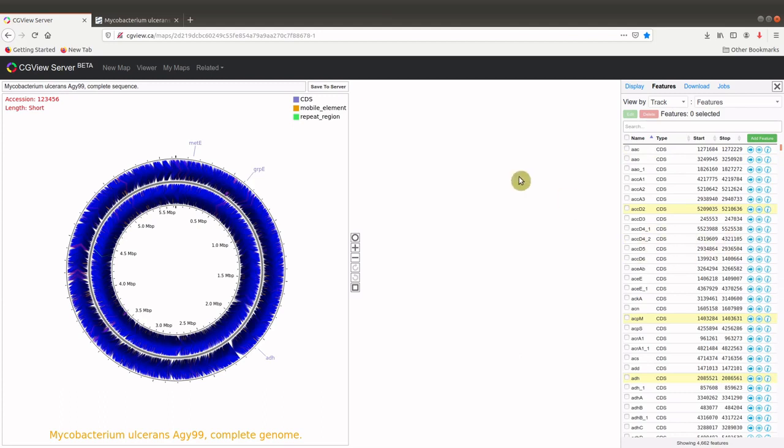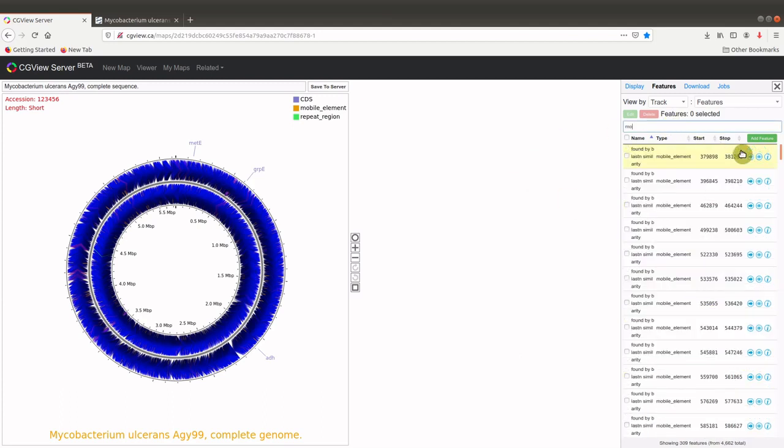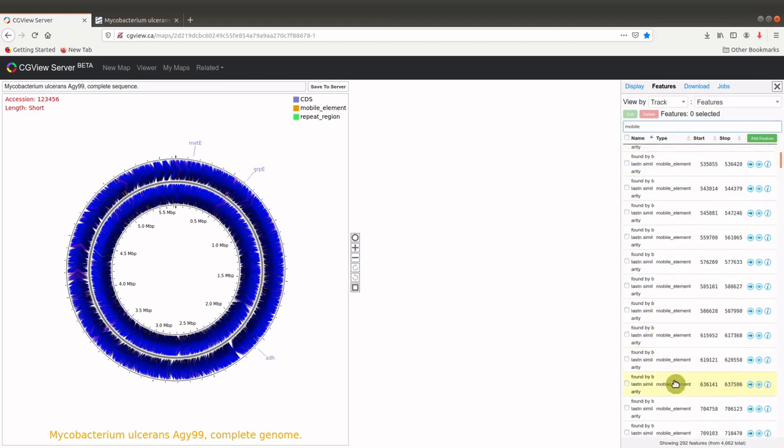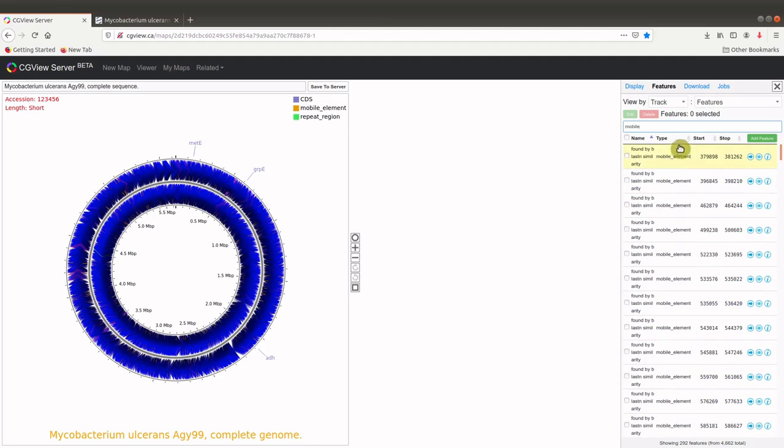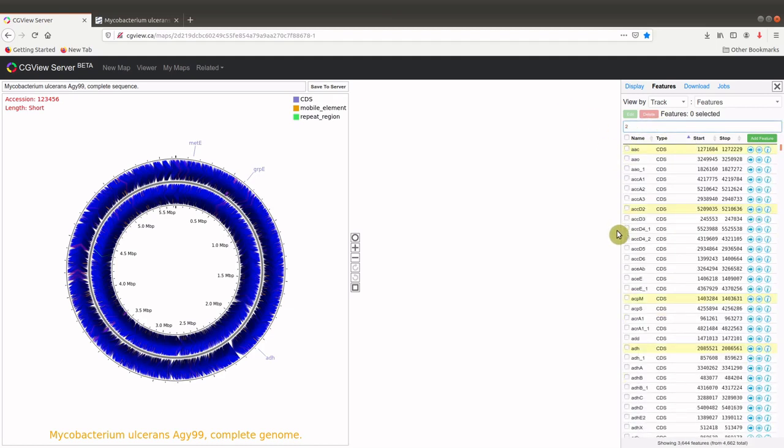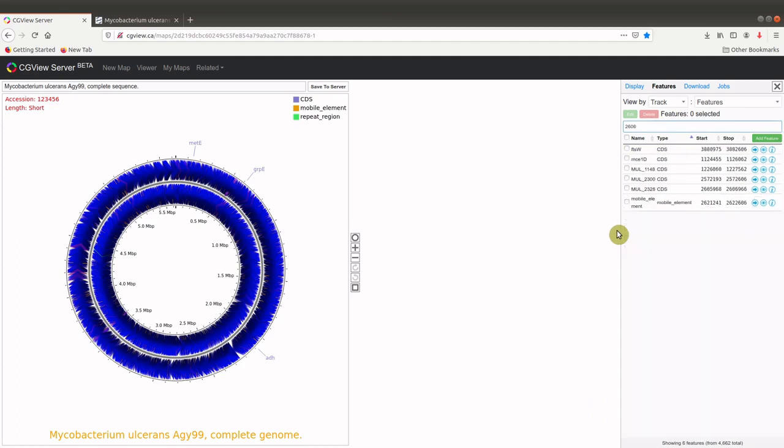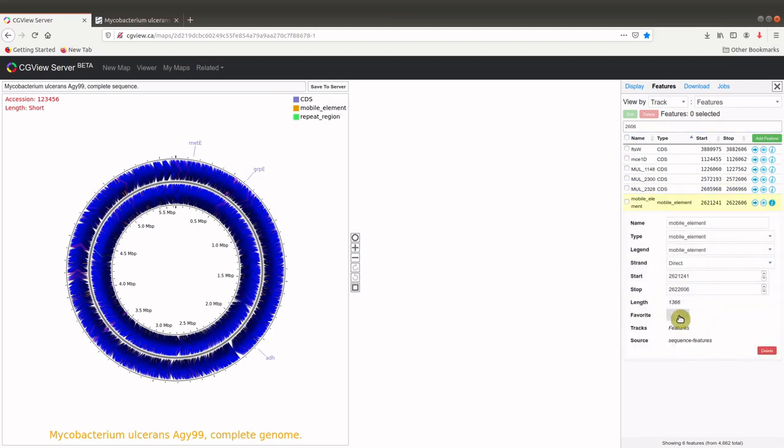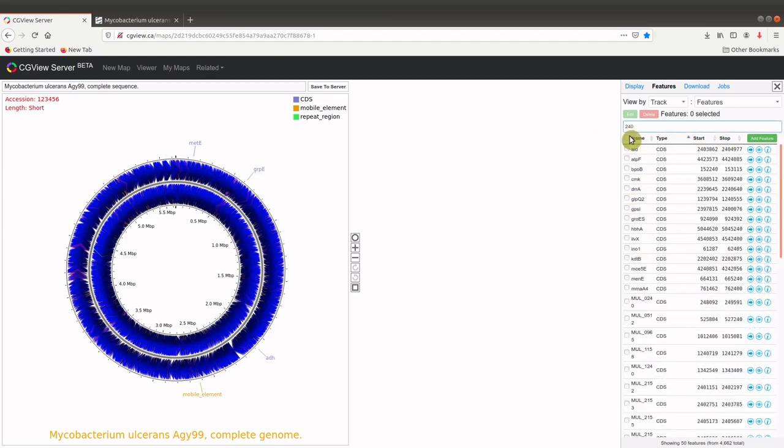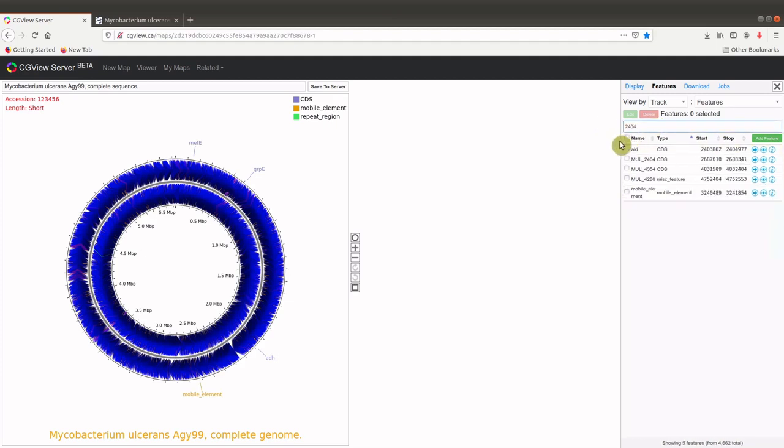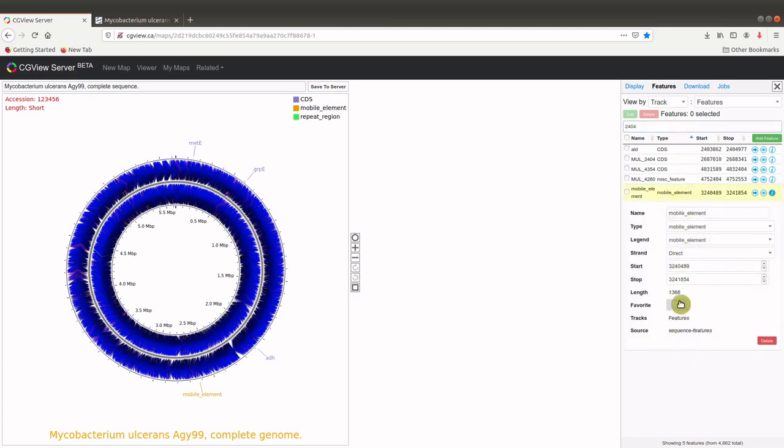Let's add some mobile elements. So we can search here. When you search like this, you have all the mobile elements may be displayed. It's a type here. So we can just do it. But since I know the specific one I want to use, IS2606, I search for that. And then you can see that using this search term, we have type CDS, type mobile elements. Because it's a mobile element, I'll use this one. And I check it. Let's use another one, 2404, insertion sequence 2404. Click on it. Let's also make it yes. So now we have that.